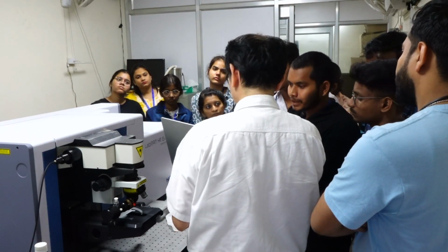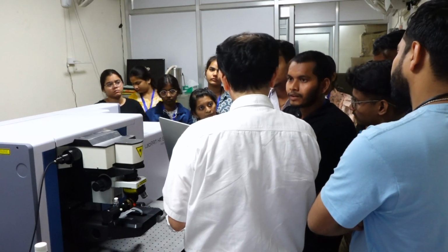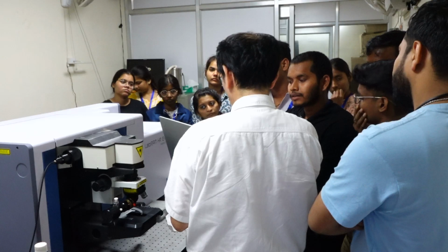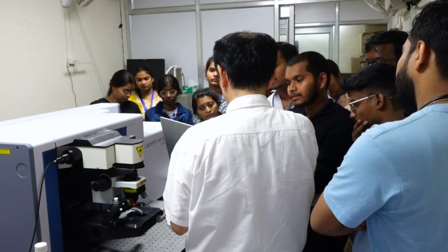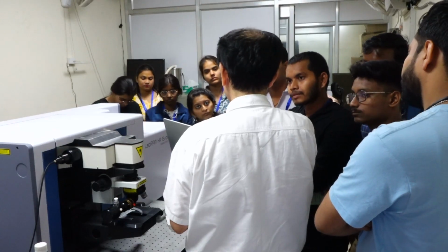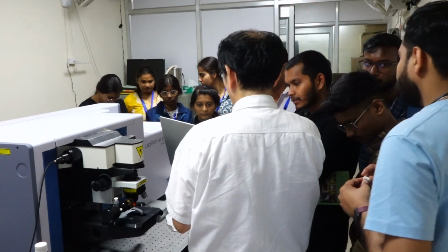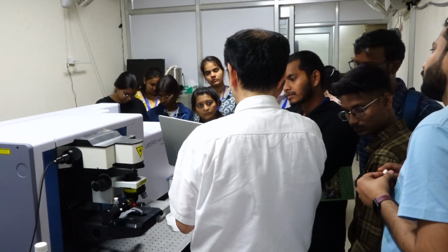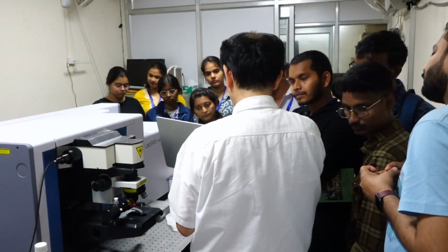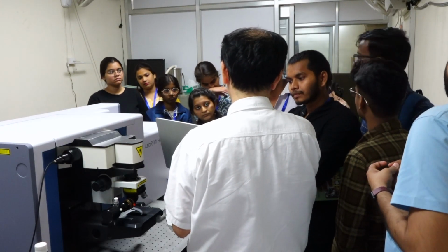So if we get the peak, we have to check our original data to match that the particular compound is present there. If you want to know what is here, then you should record the model spectrum of the pure compound, then compare. If you know there is only one compound, then the discussion is easy. If there are two compounds, then the identification becomes more complicated.